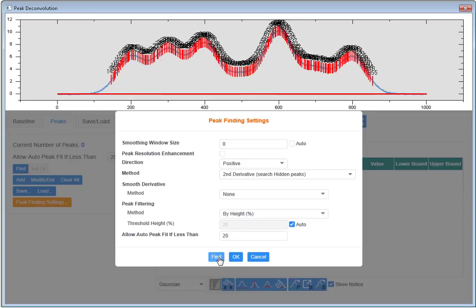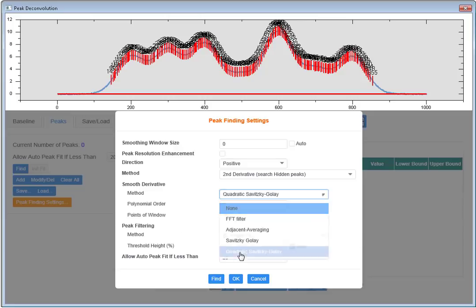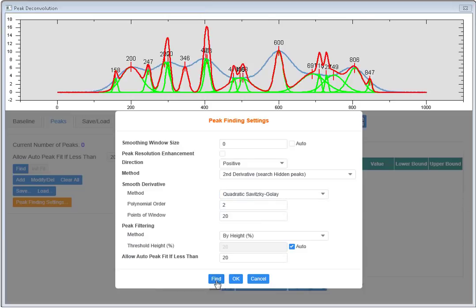When I select Find, I notice that the app finds too many peaks in my data. This is because there's a lot of noise in my data. To fix this I can smooth my second derivative and then find peaks again.